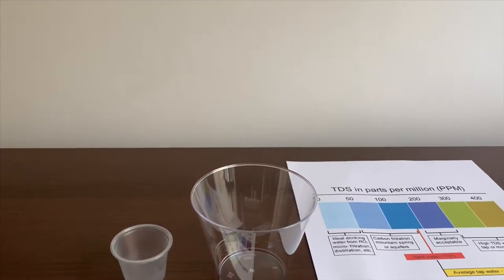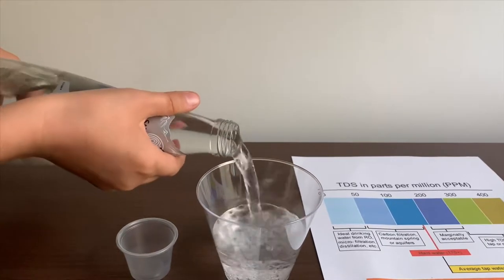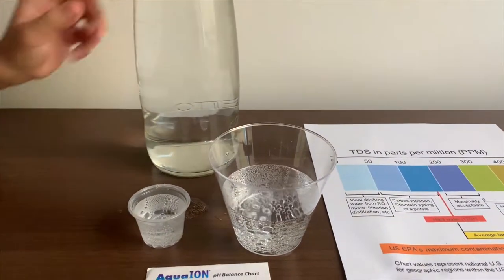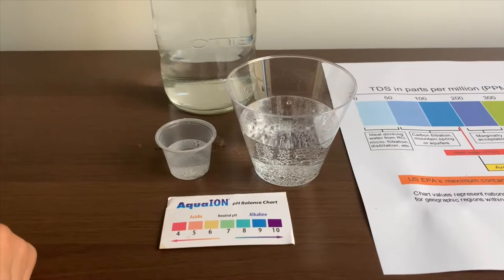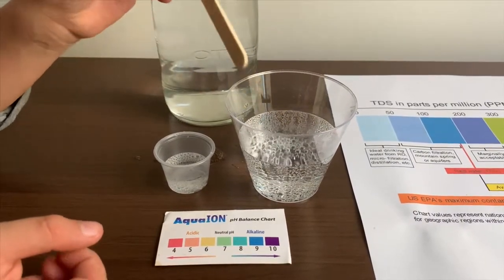Let's pour some water in. This is a little too much for the pH cup, so let's pour some back in the TDS. First we're going to test the TDS level, but let's stir it a little so we'll get a better result.